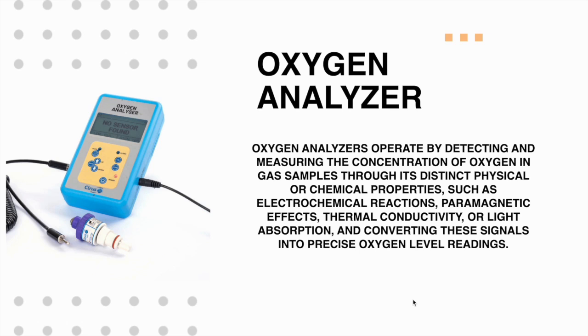Oxygen analyzers operate by detecting and measuring the concentration of oxygen in a gas sample through its distinct physical or chemical properties, such as electrochemical reactions, paramagnetic effects, thermal conductivity or light absorption, and converting these signals into precise oxygen level readings.